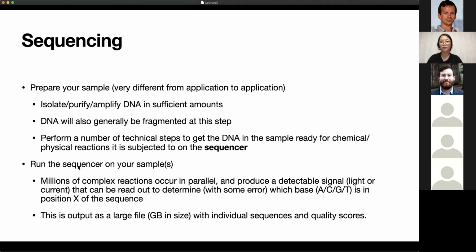A modern sequencer is a feat of engineering: nanotechnology, computer science, optics, semiconductor, fluidics. But what it really does, all of the modern sequencers, they perform millions of complex reactions in parallel. So you're basically sequencing millions of individual molecules in very, very small volumes or detection cells or nanopores. It depends on the actual technique that's being used to produce sequences.